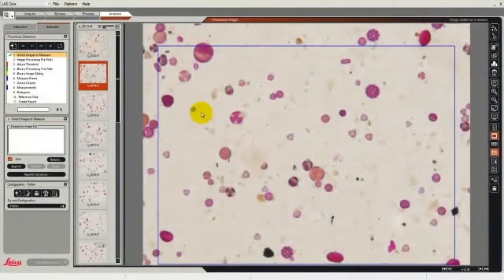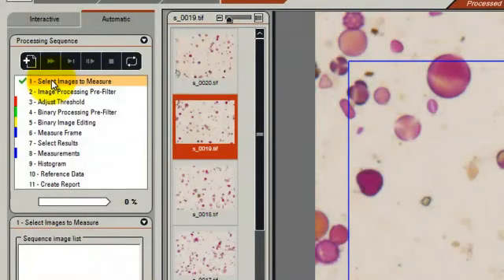Image analysis is often perceived as a very complex subject, but with the LAS image analysis module we've simplified the operation so that it's only necessary to step through the processing sequence that is ordered in a logical sequence in order to make the measurements fully automatically.